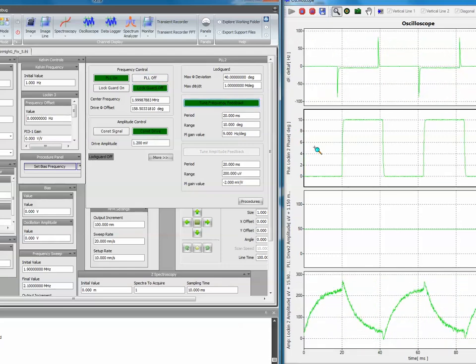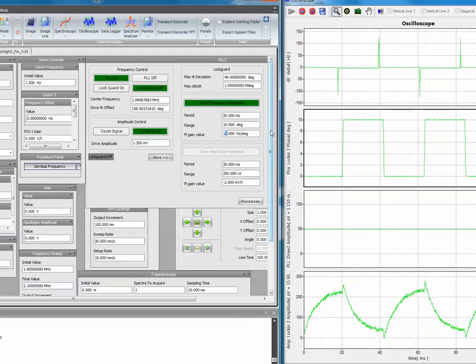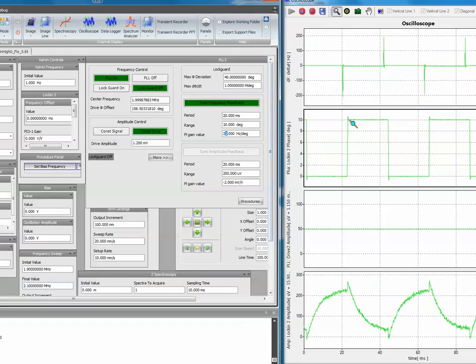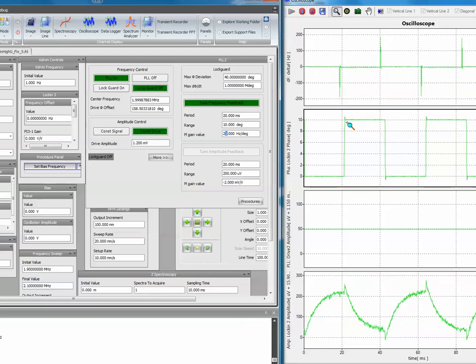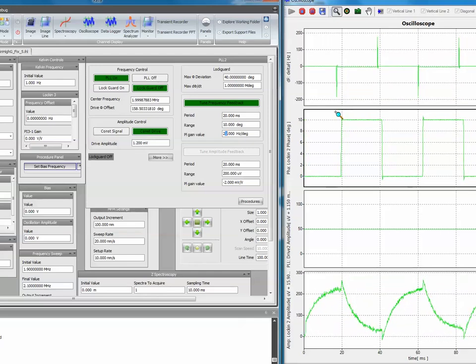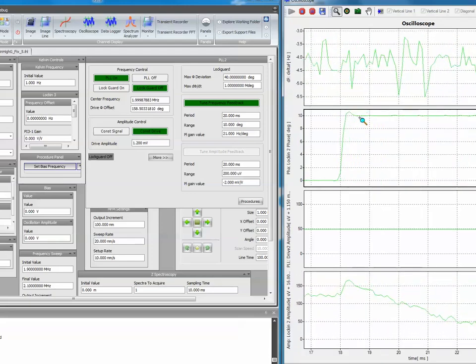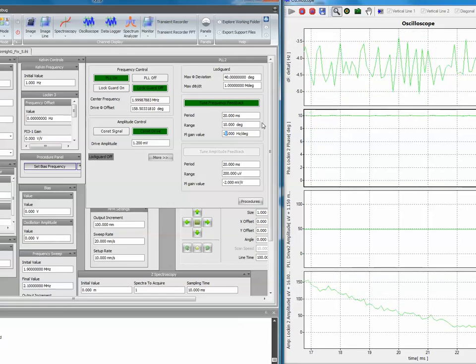In my case, the 9 hertz per degree, I think we can tune this further. If we go above 14, 15, you see a tiny little spike here. That's bad. That spike means we have ringing. If I zoom in here, you see there's some overshoot, and we want to avoid that.